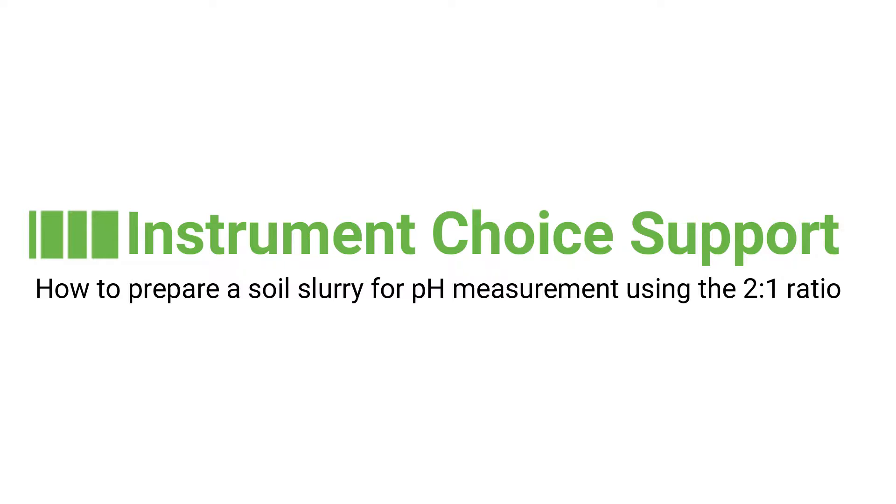Hi and welcome to another Instrument Choice support video. In this video we will show you how to prepare a soil slurry to measure the pH.